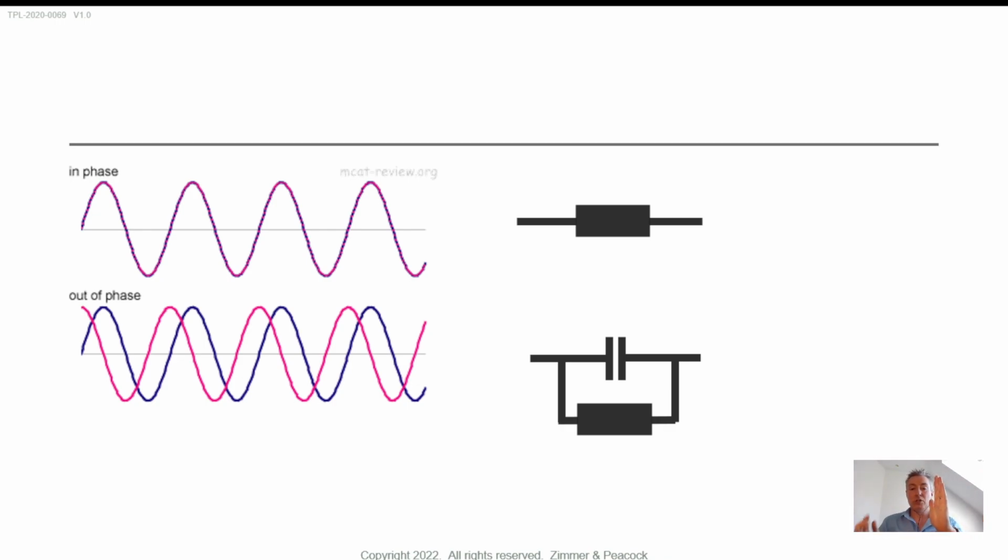It's because of this: you have an electrode, and you're putting proteins on that surface. Those are like biological polymers, and you're slightly insulating the surface. So the surfaces don't act like pure resistors. They act a bit like a resistor and a bit like a capacitor. What that means is, as I change the voltage, the current is changing, but capacitors have the slight ability to store charge, so everything is offset slightly. I change the voltage, the current changes a little bit later. And the bigger the capacitive element, the bigger the delay. Again, the software does this essentially for you, and it will tell you what these capacitive elements are.